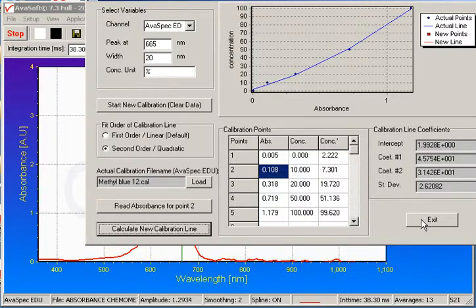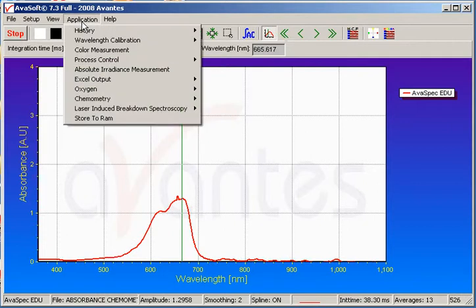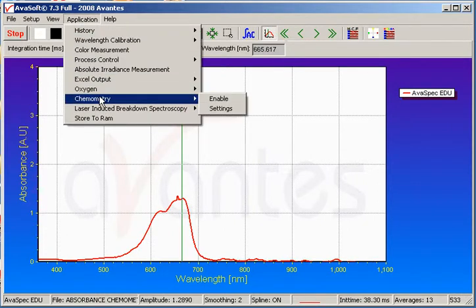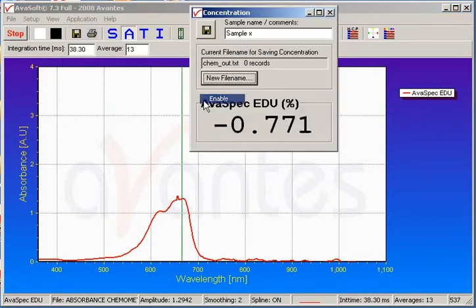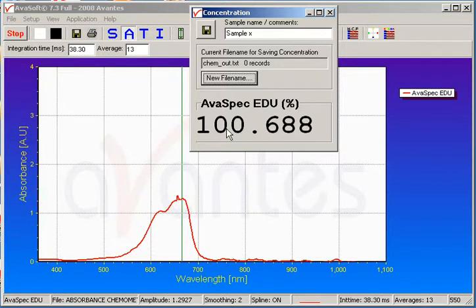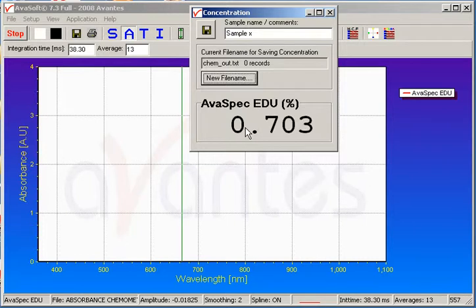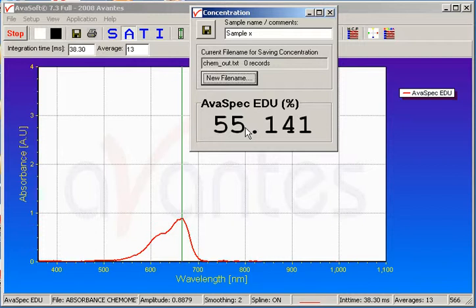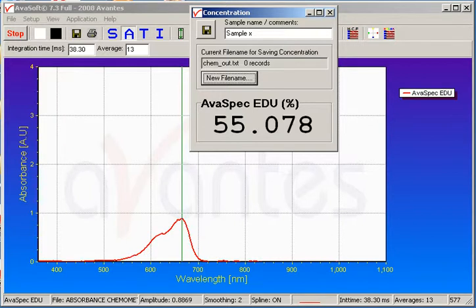Now we can exit and practically use this calibration to test an unknown. We go to Application, Chemometry, Enable. The display shows 100 percent from the most recent measurement still in the cell holder. Swapping in the unknown sample, we find that it reads roughly 55 percent. This concludes our demonstration of Avantes chemometric analysis. Thank you for your attention.